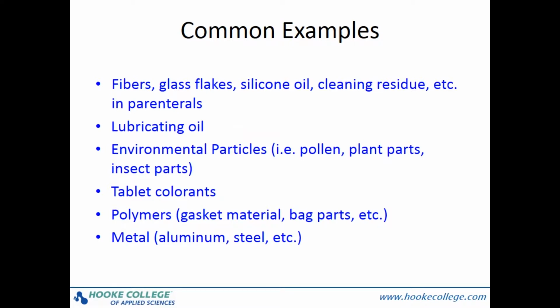What are the most common contaminants? Well, here's one list that's oriented mainly towards pharmaceuticals, but really everything and anything can contaminate our product. Knowing the most common suspects is helpful because 9 times out of 10 that's what we'll see, but we have to be prepared for the unusual.